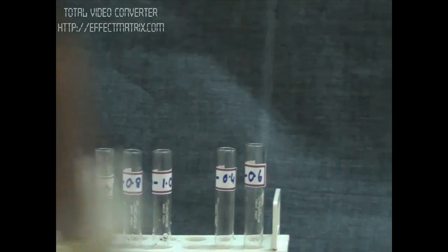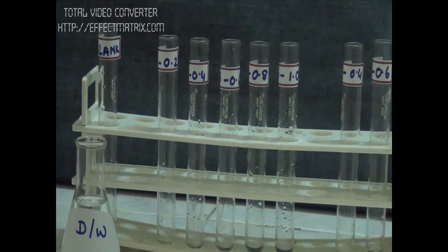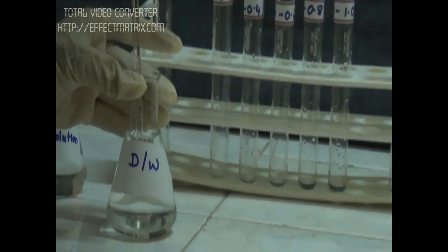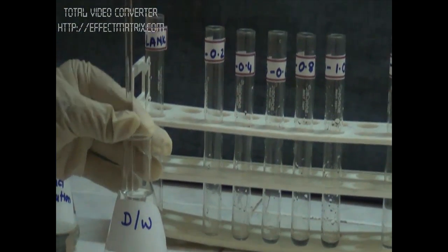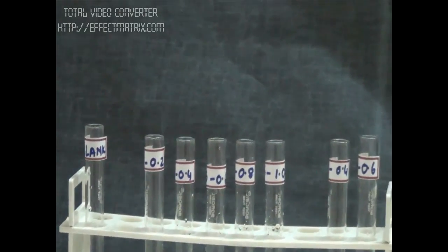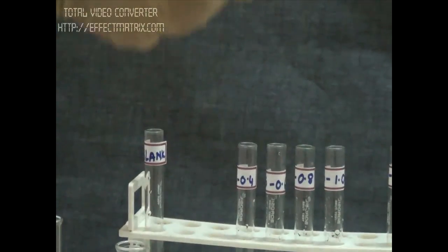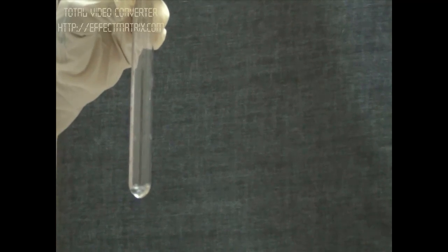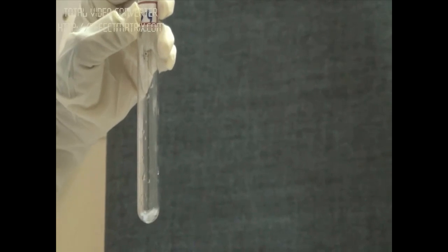Now we will make the level of all the aliquots equal by adding distilled water. In the next tube, we have 0.4 ml of standard, so I will add 0.6 ml of distilled water.